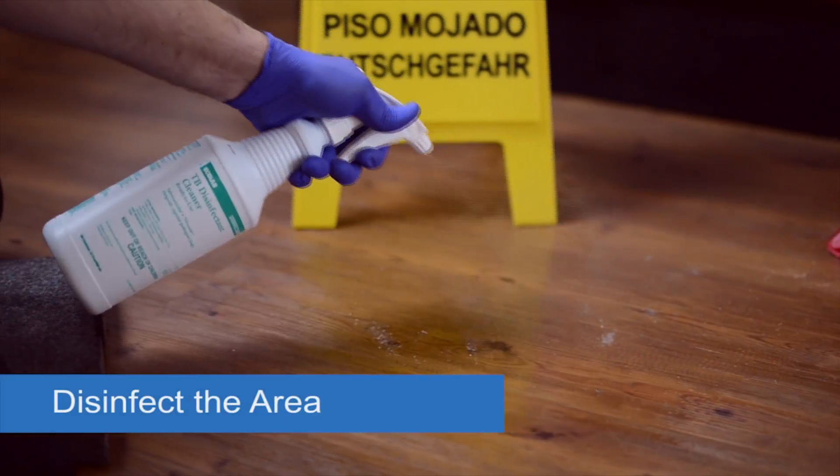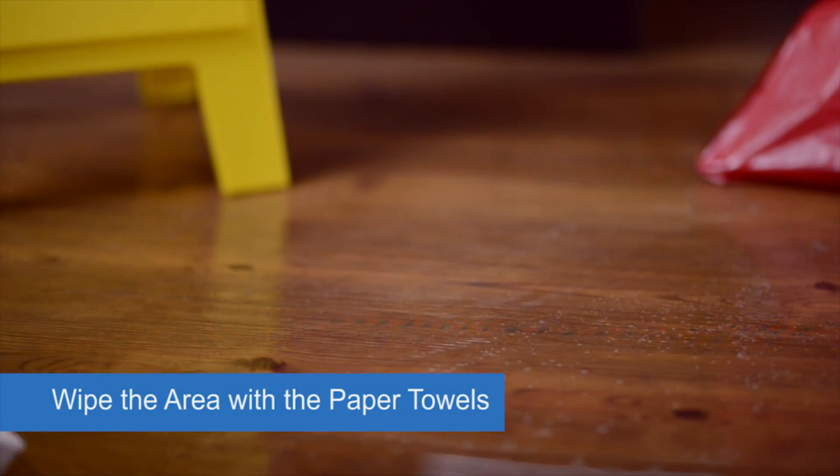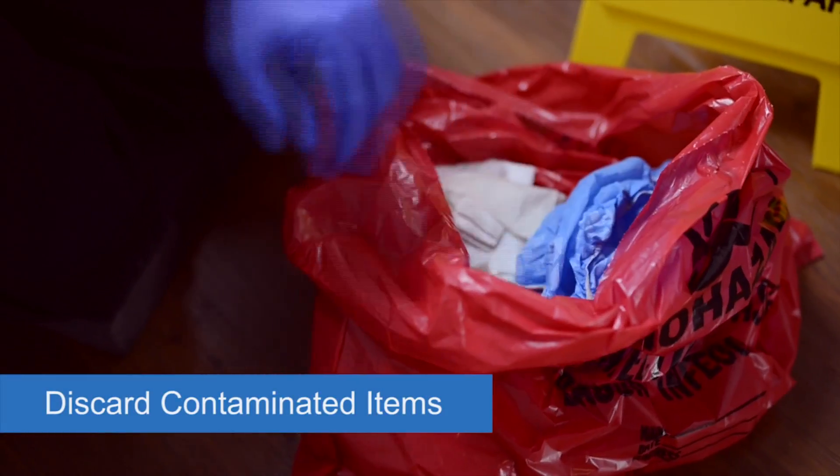Disinfect the contaminated area with TB disinfectant cleaner and wipe the area with the paper towels. Follow the directions on the product container for the appropriate contact time. Discard dirty paper towels into the outer red trash bag.